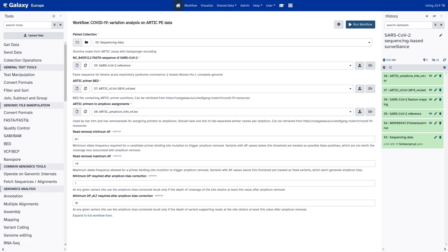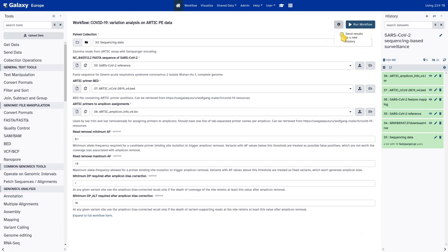We can leave the rest of the parameters at the defaults and run this workflow. You have the option, via the gear wheel icon, to send these results to a new history if you prefer to keep this prepared history pristine. But for this tutorial, it's preferable to have everything go to one history. So I just press 'Run Workflow' and off we go.